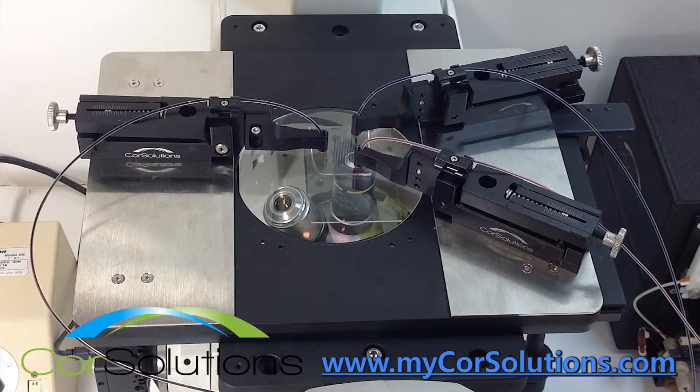This video demonstrates the use of two Core Solutions PeriWave microfluidic pumps to mix two liquids in a laminar flow mixing chip.